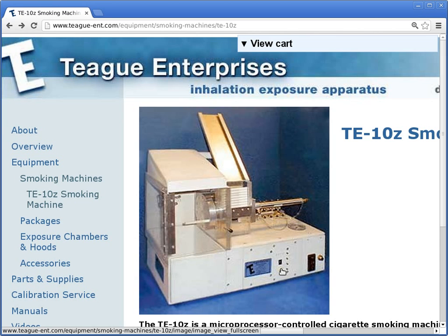Yep. So as it turns out, cigarette smoke is the most cost-effective way to make lab animals sick, with breathing problems and all sorts of other things. So this is actually the machine to make animals sick to begin with. Then they can give medication to the animals and see whether the medication helps or not. And that's basically what these machines are used for these days.